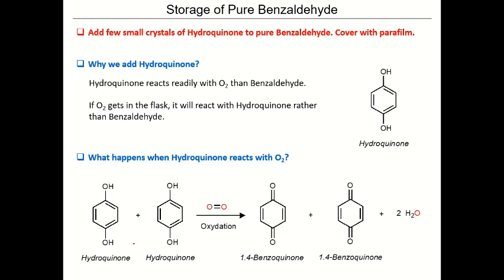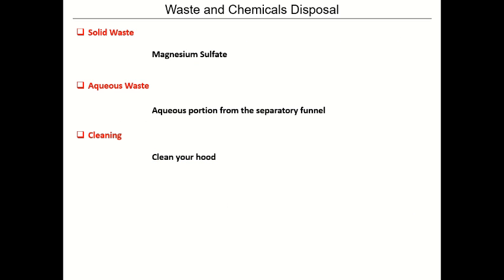And so that's the main purpose of this experiment, right? We already purified, dried, and stored the benzaldehyde, right? So the waste must be disposed of as follows, right?